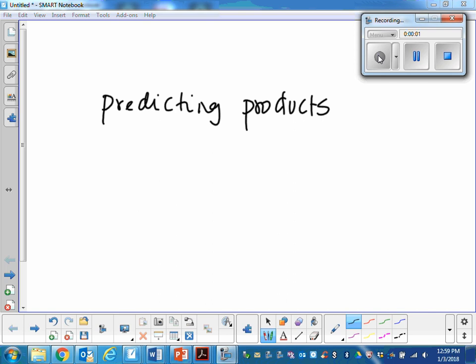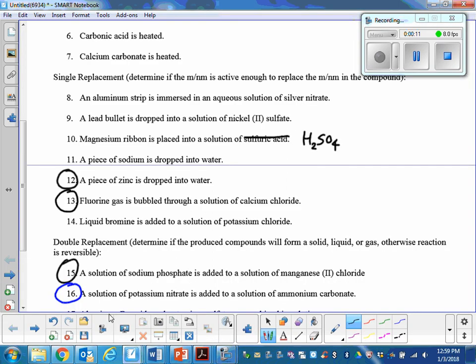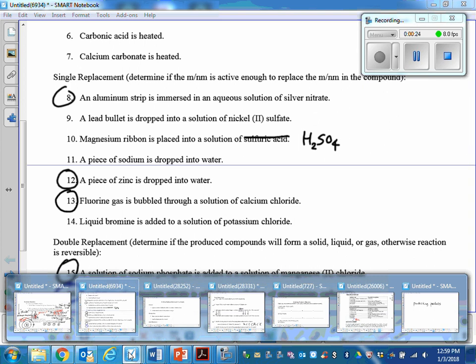I need you to be attentive. We are first going to start with single replacement reactions. The first reaction that I'm going to do in single replacement is an aluminum strip immersed in an aqueous solution of silver nitrate. Do you see that? As it says, it's a single replacement reaction.